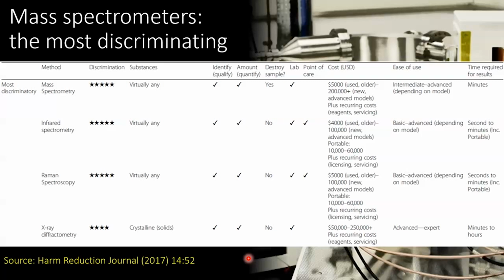So think about some of the other 5-star methods listed there, infrared and Raman spectroscopy. These are listed as 5-star, although I'd probably give those a bit of a caveat. If you have a very pure sample that you're analysing, sure, infrared and Raman, they will give you very, very clear spectra of products which you can match to known samples.